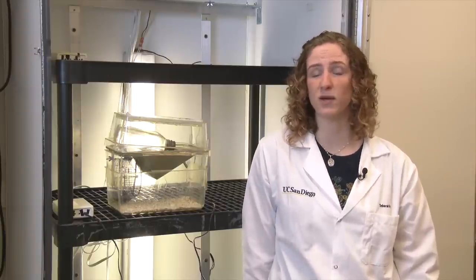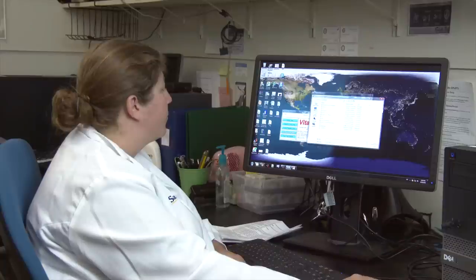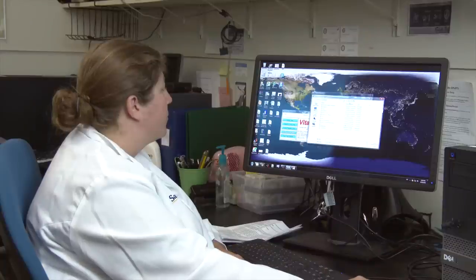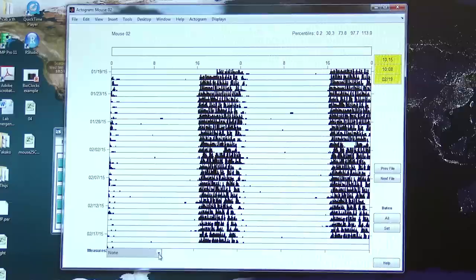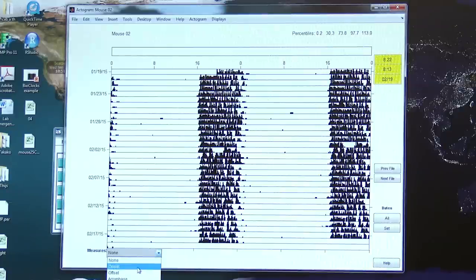Now that we've set up our experiment, what do we do while the experiment's actually running? Well, usually every day, one of the researchers in charge of the experiment will check the data through VitalView to make sure that there are no data inconsistencies.